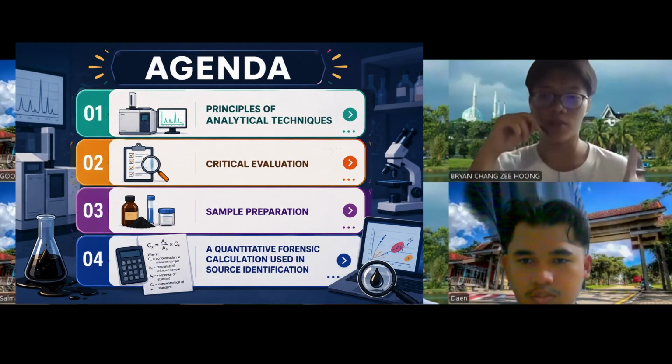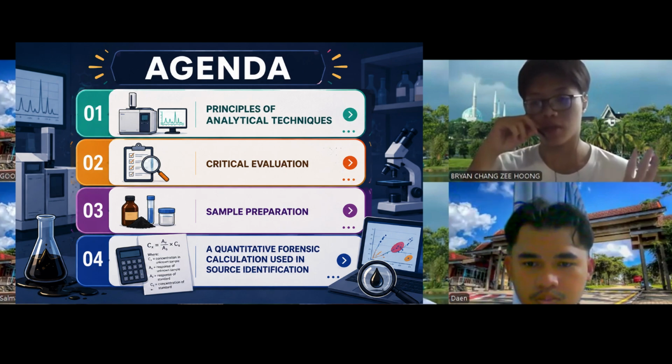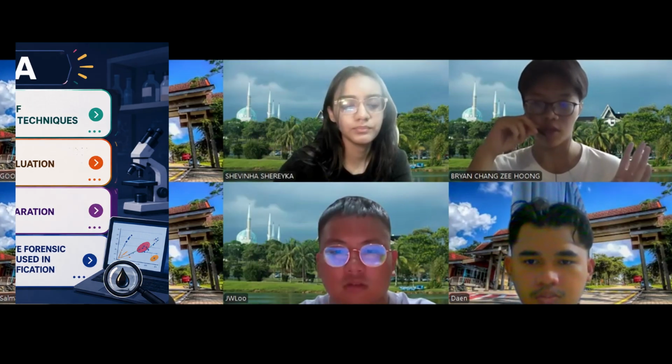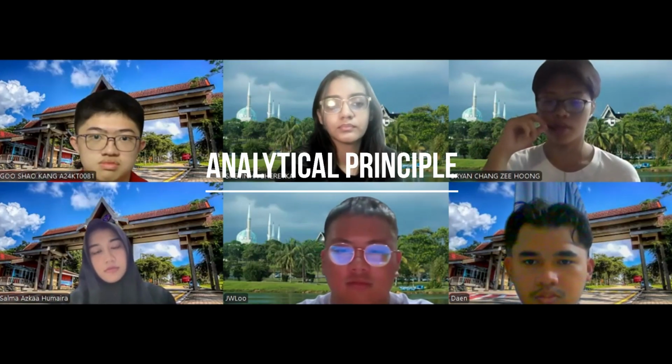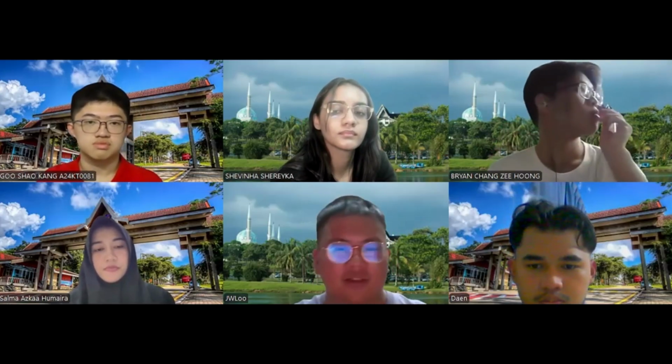We will cover principles of analytical techniques, critical evaluation, sample preparation, and a quantitative forensic calculation used in source identification. Let's begin with analytical principles, starting with Loo. Okay, thank you, Chan, for your introduction.